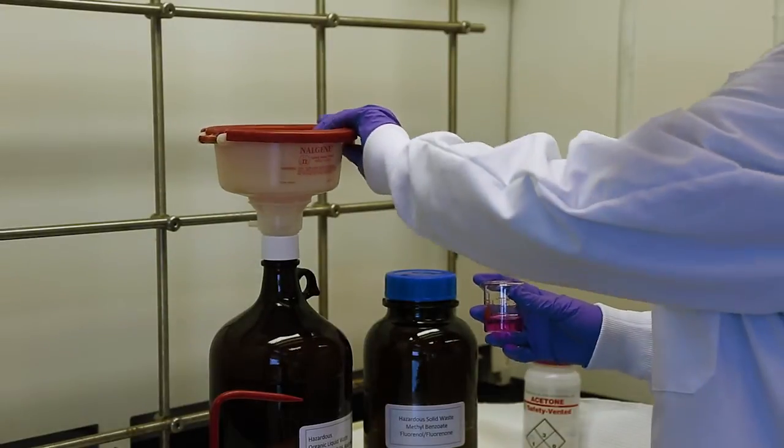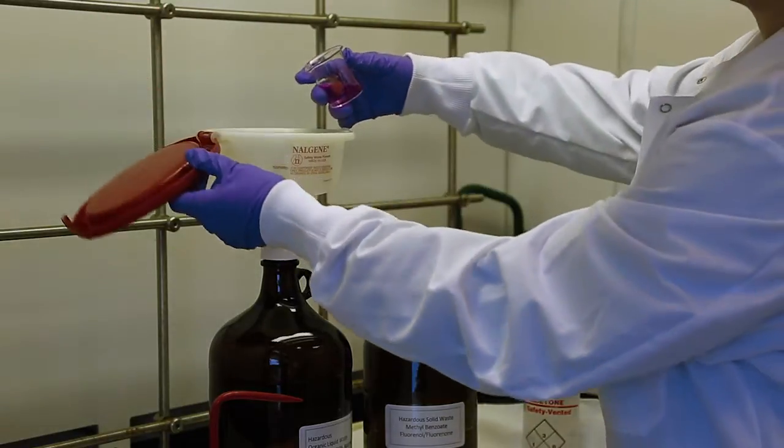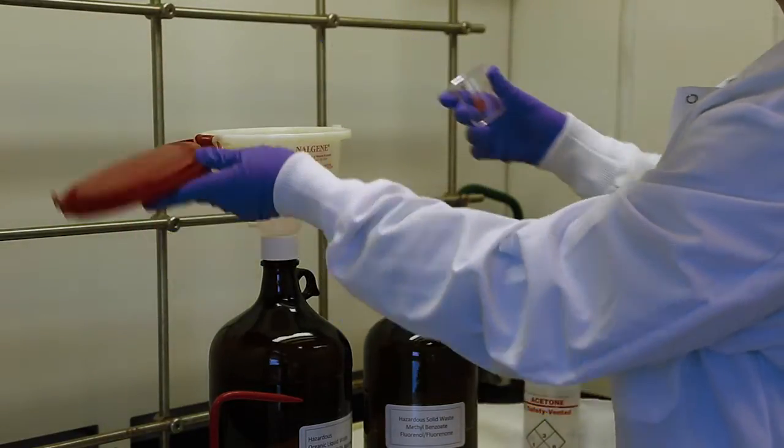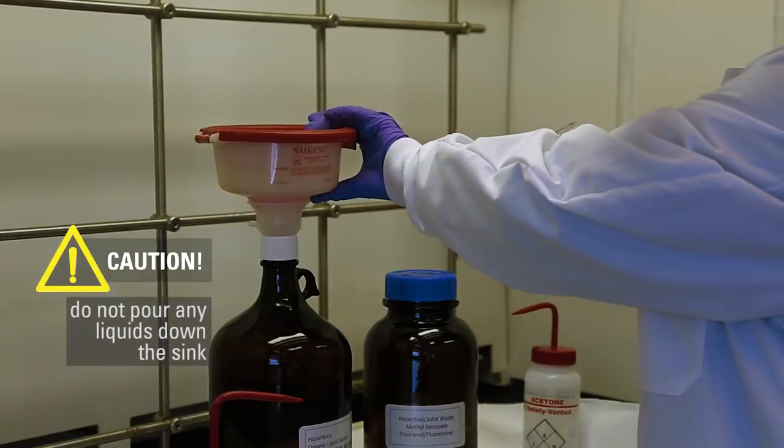Use the attached funnel to pour all liquids into the bottle. Close the top of the funnel after every addition of waste. Do not pour any liquids down the sink.